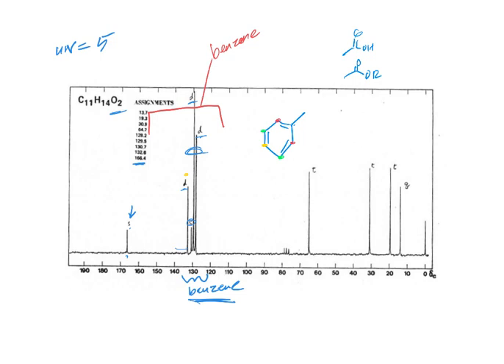All right, so what else do we have here? You have 3 CH2s and a CH3. Right, we've got 3 CH2s and a CH3. So what's a good way to assign those? The 65 ppm is the one connected to the oxygen and the ester. Right?